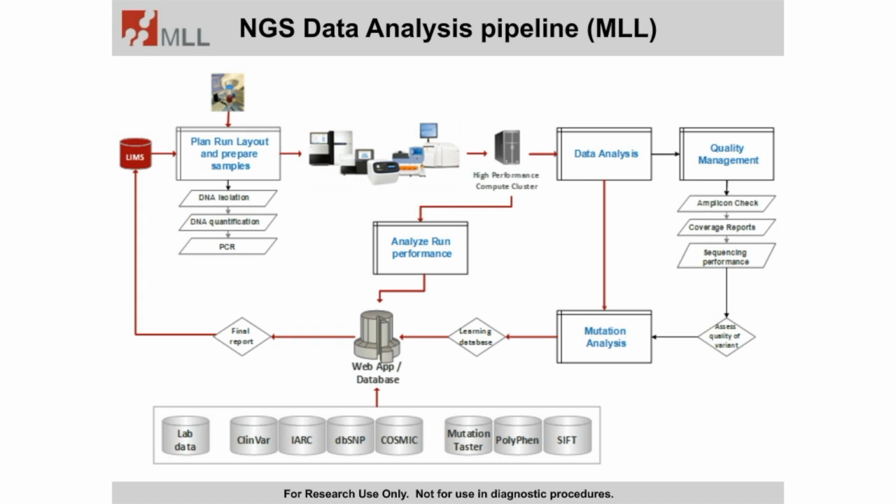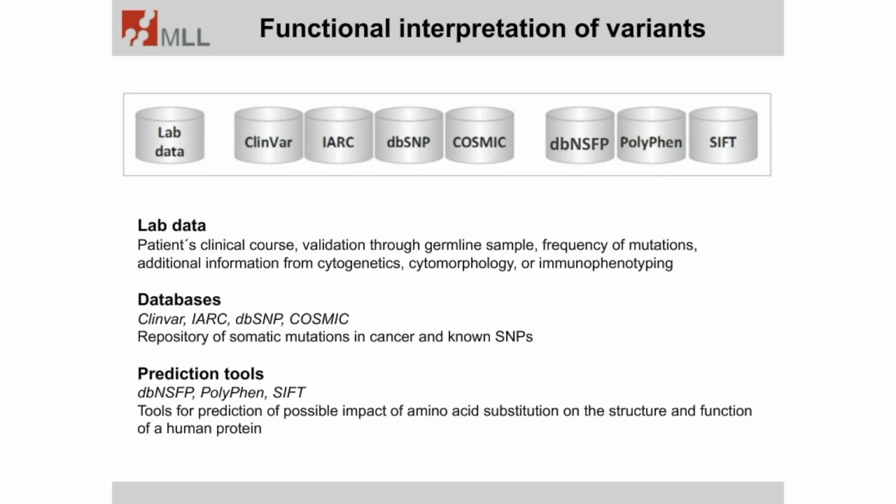And having this in-house, the very important thing now, and this is really the most complex task from our perspective, using NGS today in routine as a diagnostic tool or also in research, is that it is difficult to accurately automate this process.